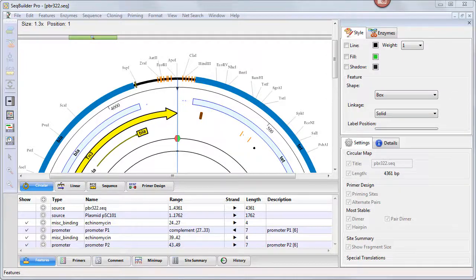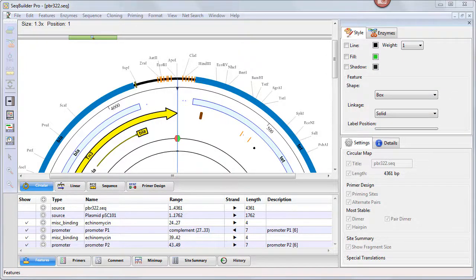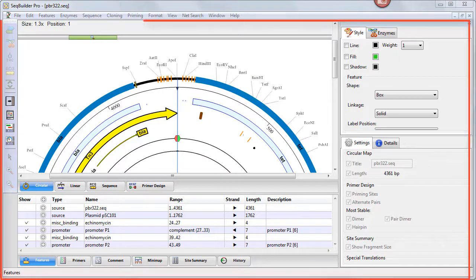New to LaserGene 15, SeqBuilder Pro is even more powerful and easy to use than its popular precursor, SeqBuilder. This video will highlight the many enhancements that have been made to SeqBuilder Pro's main document window.